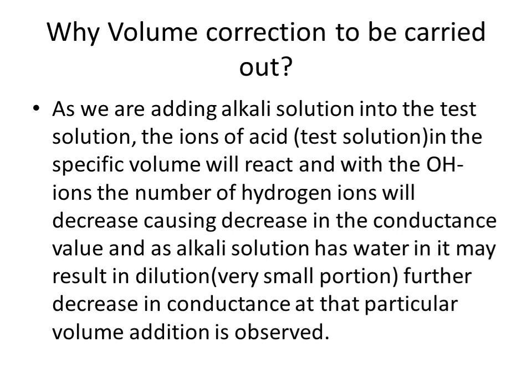But you are adding sodium hydroxide solution. Whenever you use the word solution, it is a combination of two components. One is solute and the other is solvent. So your sodium hydroxide solution has water in it. Whenever we add water, it is what we generally call dilution. Whenever dilution is done, specific conductance decreases. So during conductometric titrations, the decrease is observed due to two factors. One is the chemical reaction between the acid and base, and the other is the dilution effect. To correct this dilution effect, we have to go for volume correction.